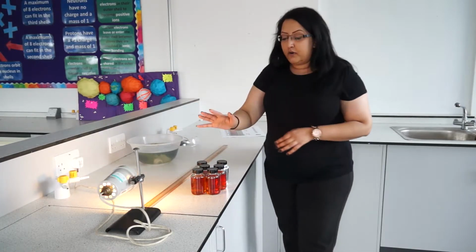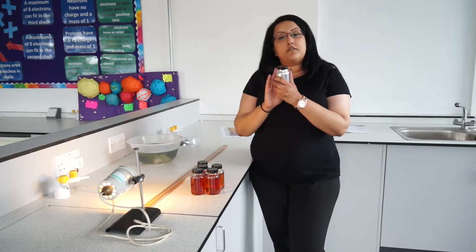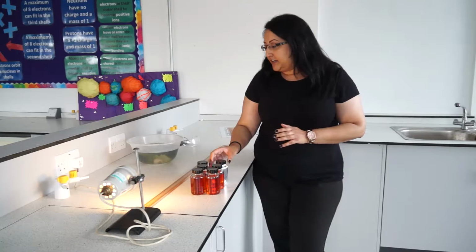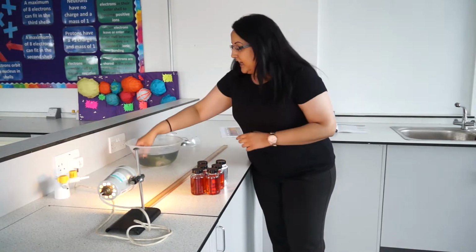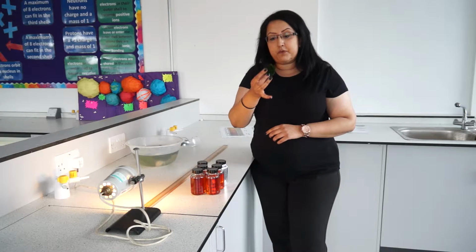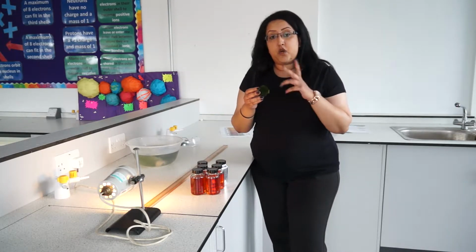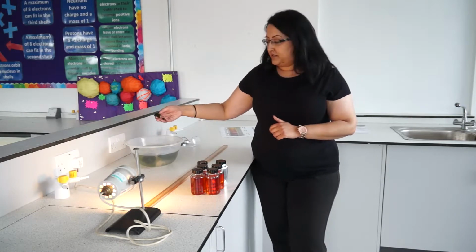So you need 6 bijou bottles with hydrogen carbonate indicator in them. One of them you need to cover completely in foil. This will be your control. And you will need some algae balls. Algae balls look like this. They're sometimes called moss balls, and you'll either get one of these and chop it up, or you'll have some chopped up for you. They're really easy to chop, just get some scissors.